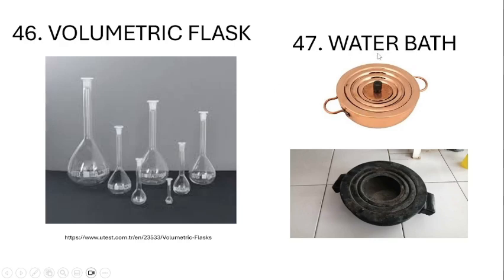The next, we have your water bath. So this is made of copper. It is like a bowl. It has rings around. So over time, frequent usage will lead, just like the burner, to discoloration. That's why this is now the actual water bath you will see in the lab, but it was once shiny.